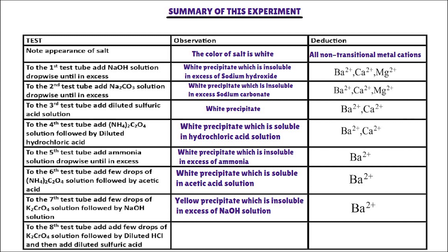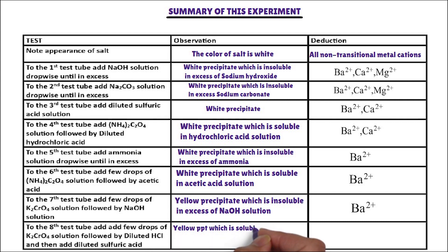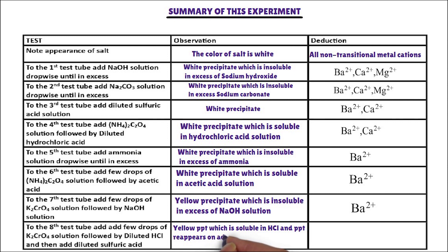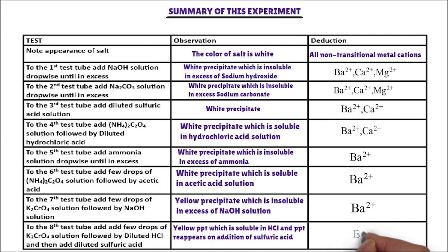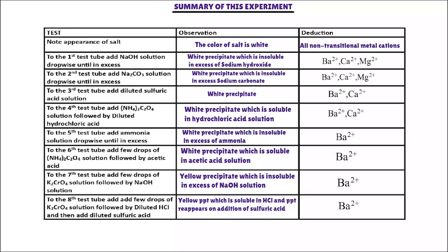Another confirmatory test. In the eighth test tube, potassium chromate solution followed by hydrochloric acid solution is added, followed by sulfuric acid. The cation that forms a yellow precipitate with potassium chromate, where the precipitate is soluble in hydrochloric acid and the yellow precipitate reappears on addition of sulfuric acid, is barium ion. Barium ion is confirmed. Barium ion has many confirmatory tests, but one from the above is enough to confirm the presence of barium ion in solution.